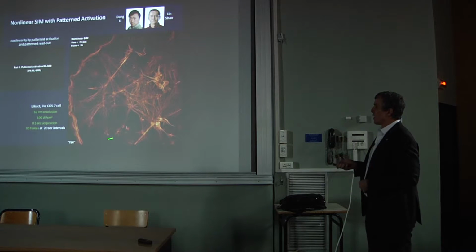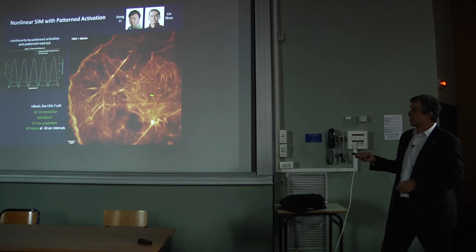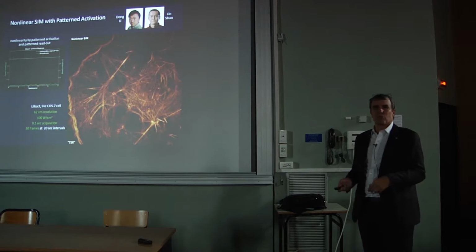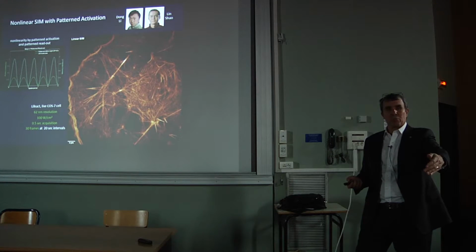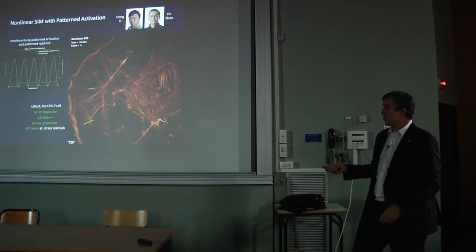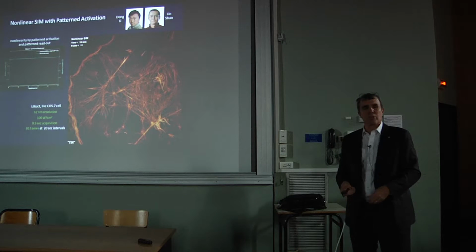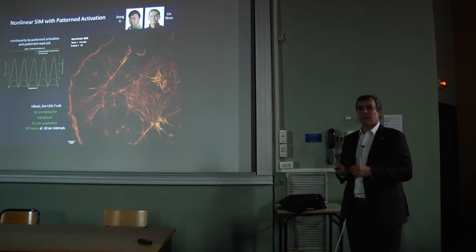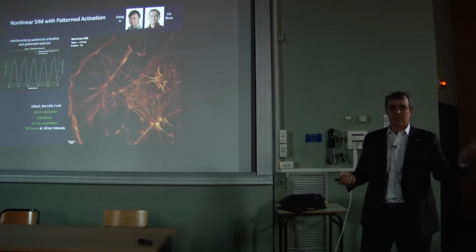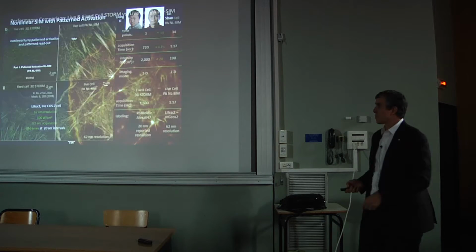So once we do that, we can take images as fast as a third of a second. This is a half a second here, and take anywhere from 1 to 3 or 4 dozen images. It's not as many images as we get with the high NA SIM, because this requires 25 images to reconstruct. The high NA SIM requires only 9. But it still can do live imaging. It's just, again, the trade-offs: spatial resolution for temporal resolution and number of frames.